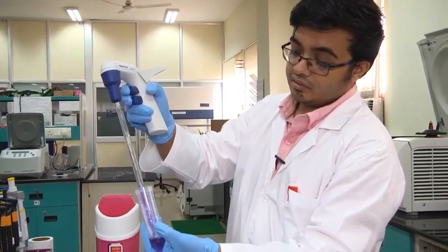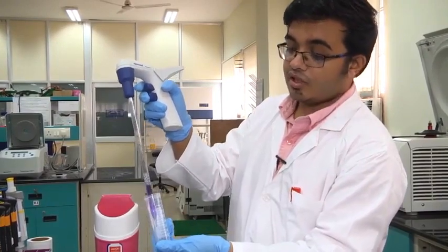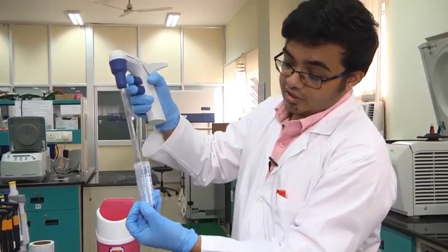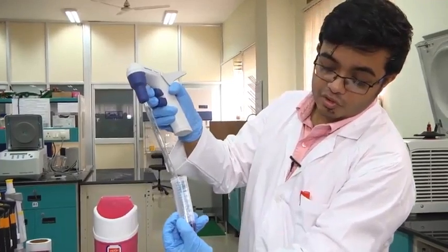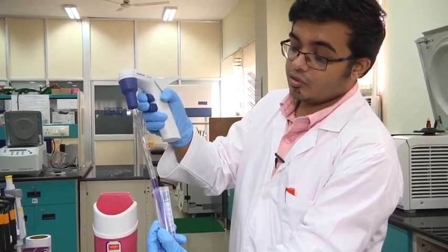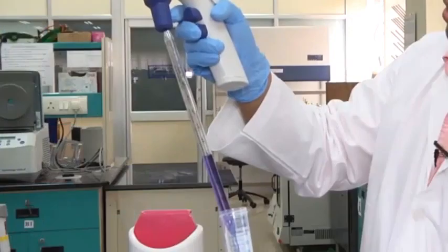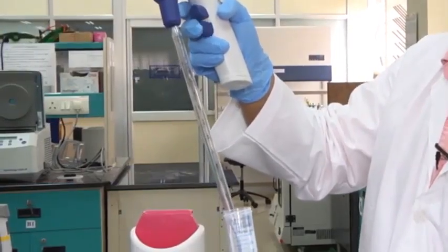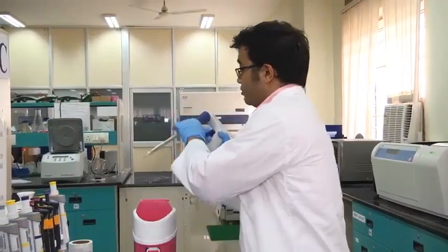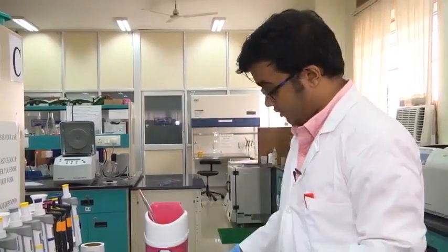I'm collecting the liquid. Oh, see, I was talking about an error, right? If I do not dip it properly, you saw what happened. Air bubbles entered the serological pipette. So I don't want that. So dip it in nicely. Perhaps, I'm sure it's visible now. Dip it in nicely, and go at a uniform pace. You are collecting the liquid, and dispense slowly. You can dispense drop by drop, or if I increase the pressure, I can dispense the liquid as a jet. So this is how we use pipette controllers to pipette out comparatively larger volumes of liquids.